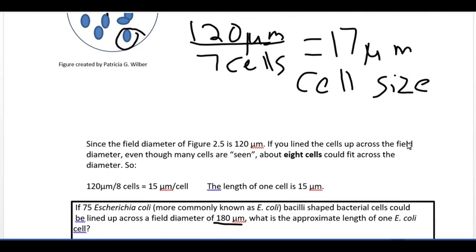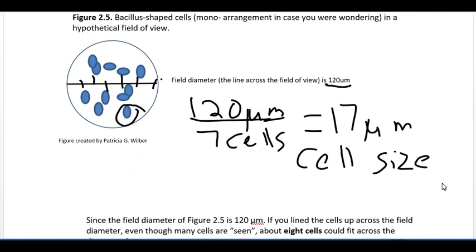Now, one of the things we do encounter a lot with cell size estimation is you're looking at really, really, really tiny cells with bacterial cells. And so the cocci in particular are really, really tiny. If you can find areas where they're arranged in a chain, and sometimes even with the cluster arrangements, the Staphylococcus, sometimes you still might find groups of 3 or 4 of those. And let's say 6 of those are in my chain.